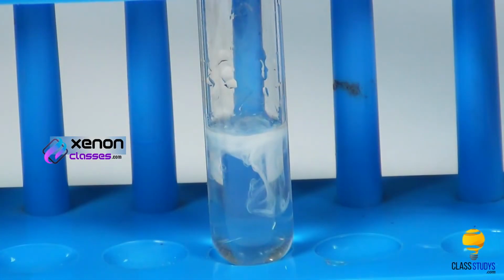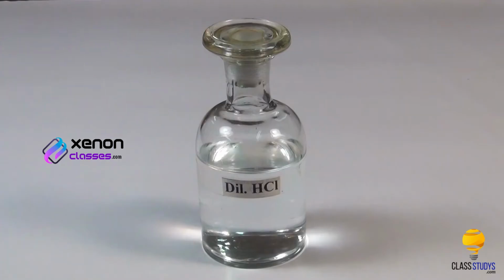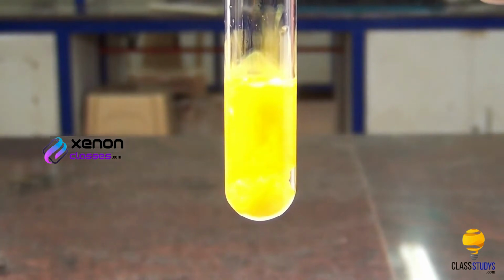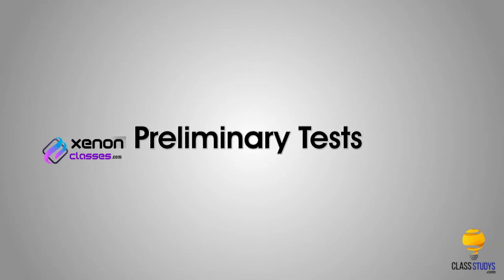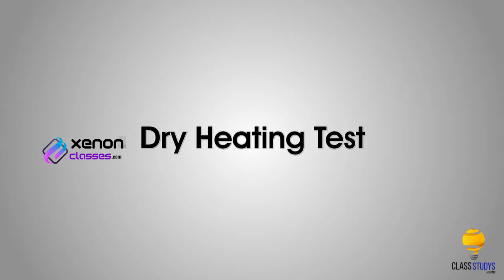In Group 1, lead-2 ions are precipitated as their chlorides by adding dilute hydrochloric acid to their solutions. Our aim here is to test for the presence of Group 1 lead ion in a given salt. First, we look at the preliminary tests of lead ion. Dry heating test.